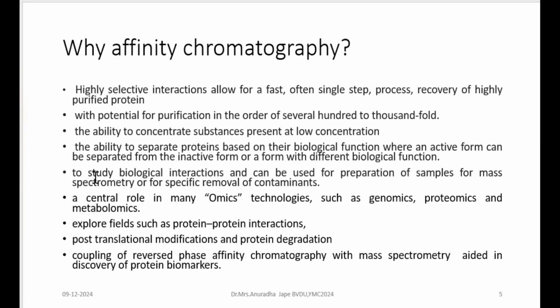Further, when you use such a specific system of affinity chromatography, it is not only for enzyme assays or purification of the protein of your interest, but it has also been of great help in the biological scenario with reference to research and analysis. For example, it has been explored in many of the omics technologies.